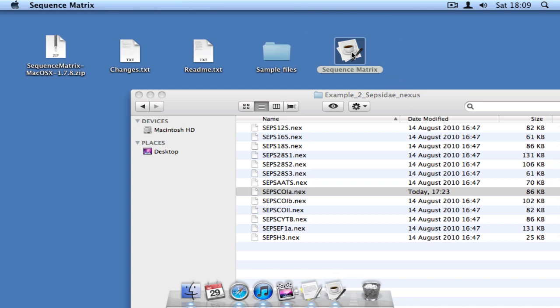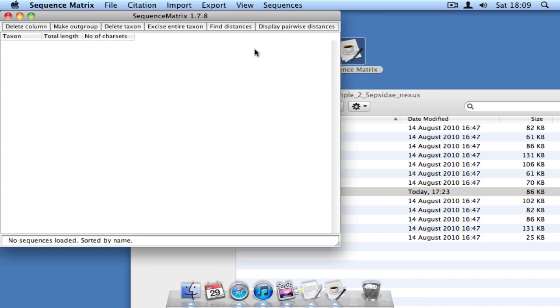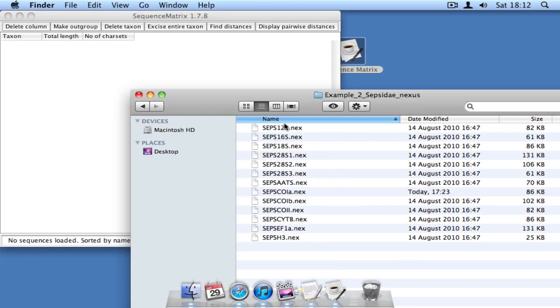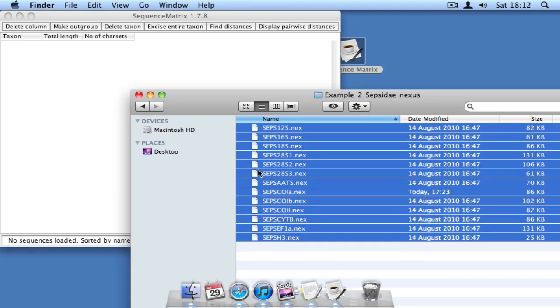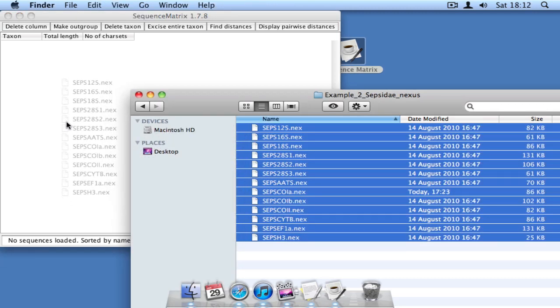To automatically concatenate sequence data from different Nexus files, simply select all the files, then drag and drop them into the Sequence Matrix window.